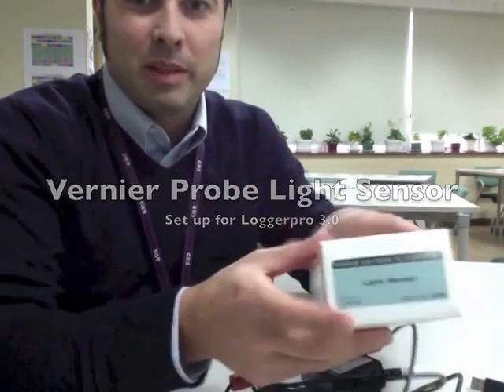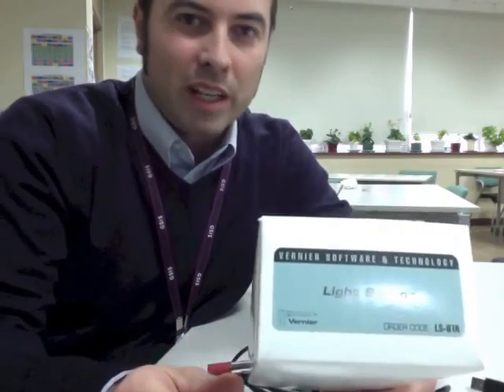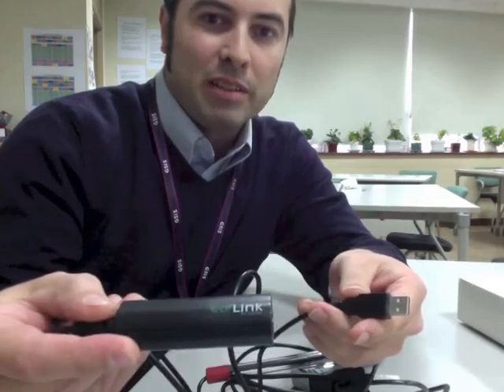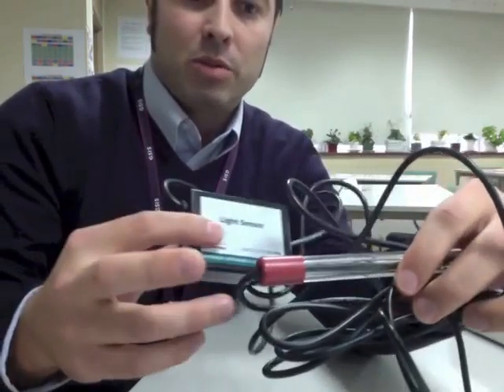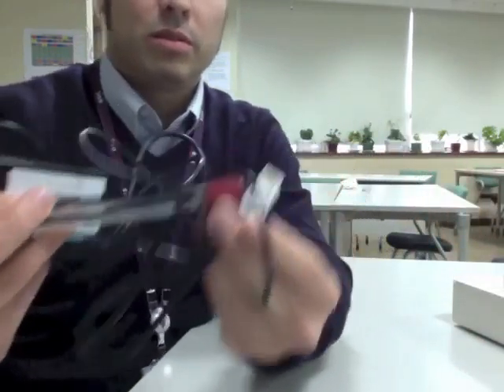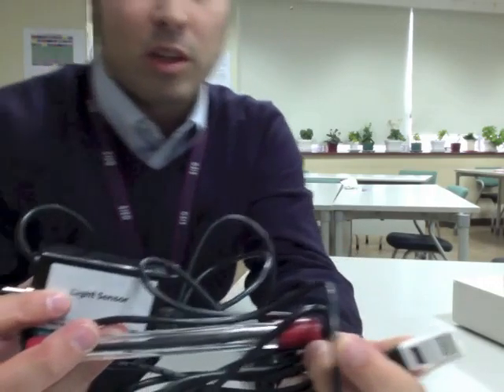Alright, welcome everyone. We're going to be installing, or at least putting together, the light sensor probe today. So I'm going to walk you through that here quickly. First thing is you've got your Go Link here as well. This is going to attach between your computer and the probe itself. And we also have our light sensor. That comes along with the actual sensor here, which is attached, and then the cord that attaches into the Go Link.